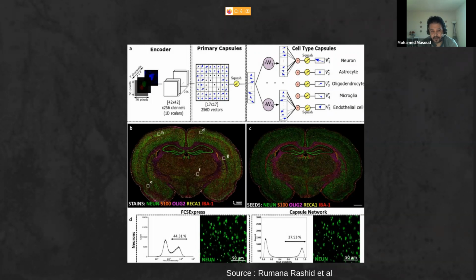So this capsulation uses in each neuron a complete vector of features. And the result comes out in a more accurate classification model.